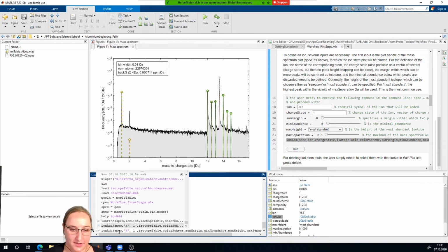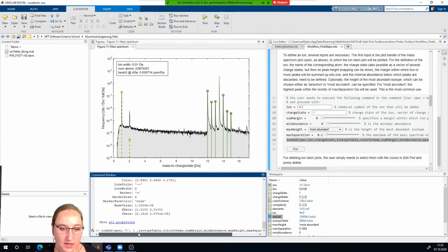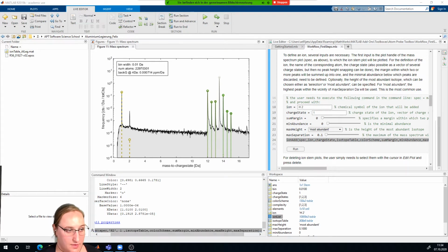I forgot the closing bracket at the end, sorry for that. Okay, so that's in general.